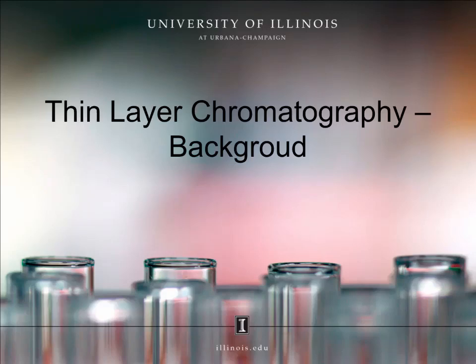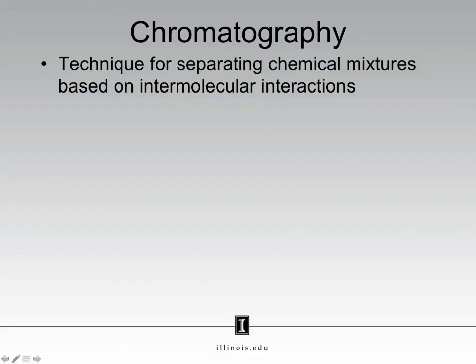Thin layer chromatography, background. In this webcast, we will discuss the first organic laboratory technique that you will learn for this course. To begin, we will start with what chromatography is, and then delve more specifically into thin layer chromatography, in terms of how it works.